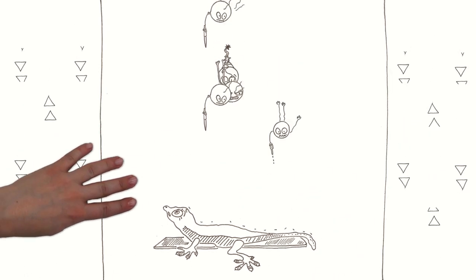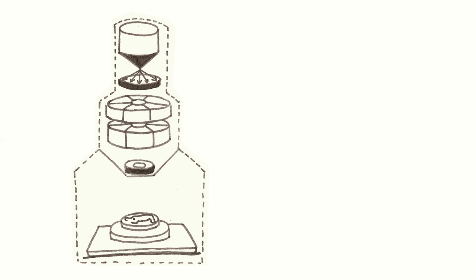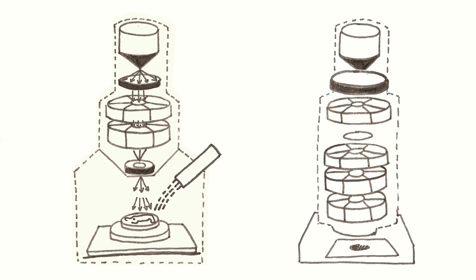Electromagnetic lenses focus the electron beam on the examined sample in an optimal way. During its entire journey, the electron beam goes through a number of apertures with various diameters. The smallest ones can be just a few thousandths of a millimeter. These apertures stop undesirable electrons from creating the image.